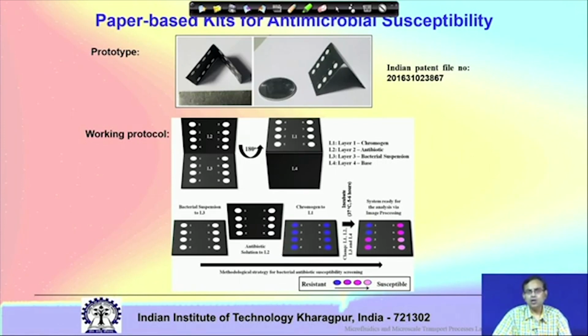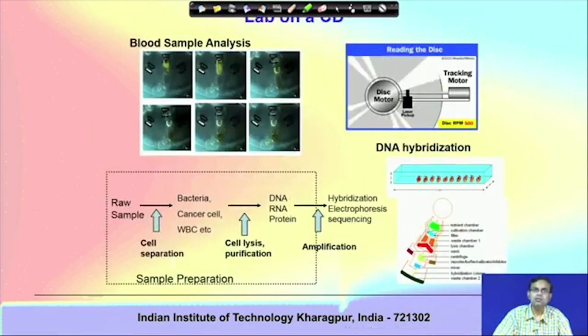Of course, this technology is at its infancy and lots of additional trials need to be made, but I think this is one of the very critical applications. Not just routine diagnostics, but also studying antibiotic resistance, these kinds of challenging propositions may actually be addressed by using paper based technology.